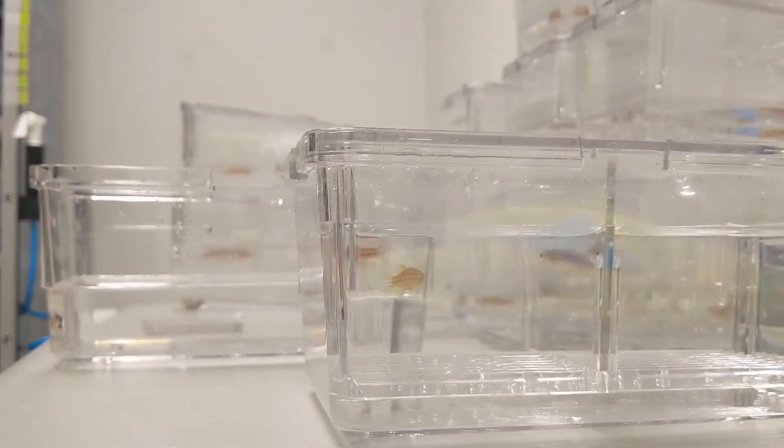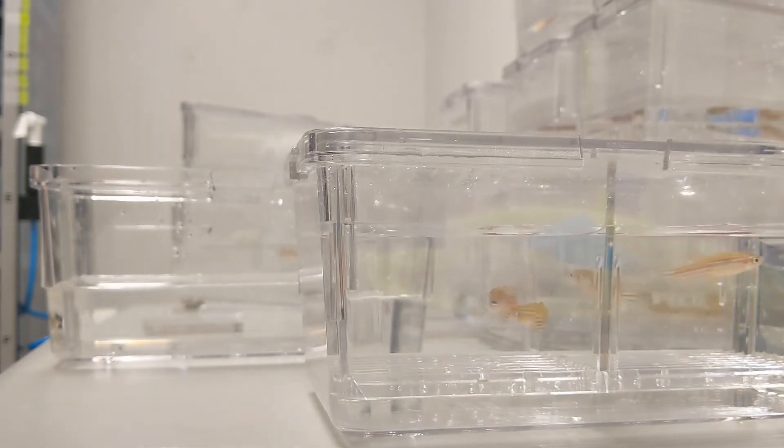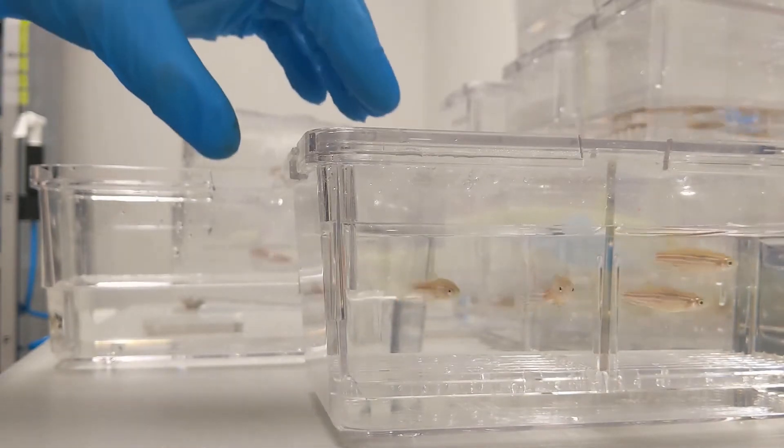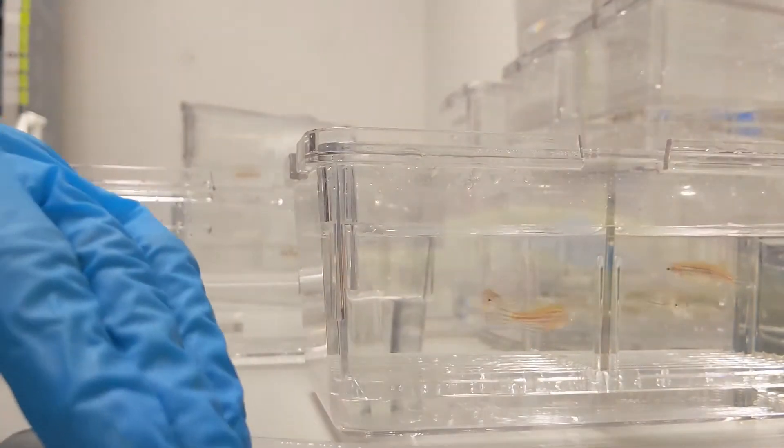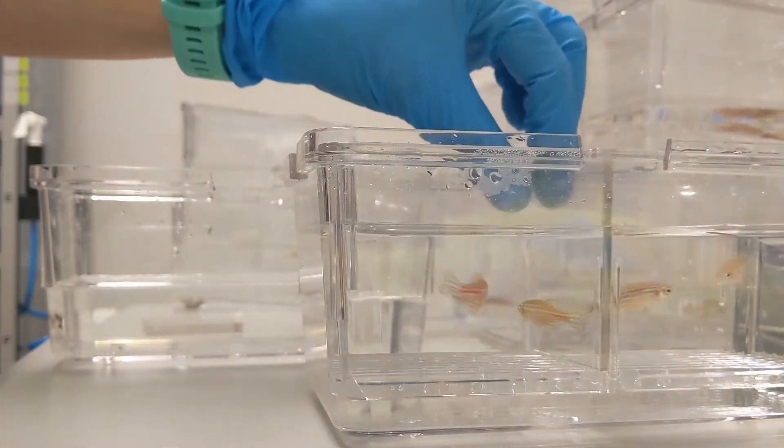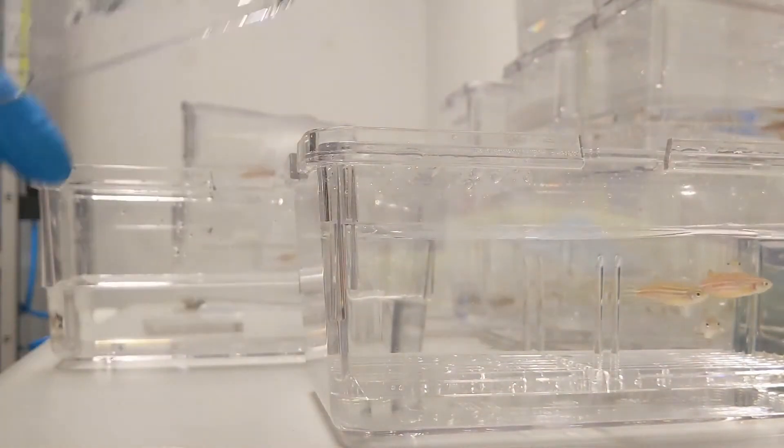We set up breeding pairs the night before crossing them. The crossing cages have a divider dividing the males and the females, and a grate on the bottom that the embryos can fall through. This prevents the embryos from being eaten by the parents.